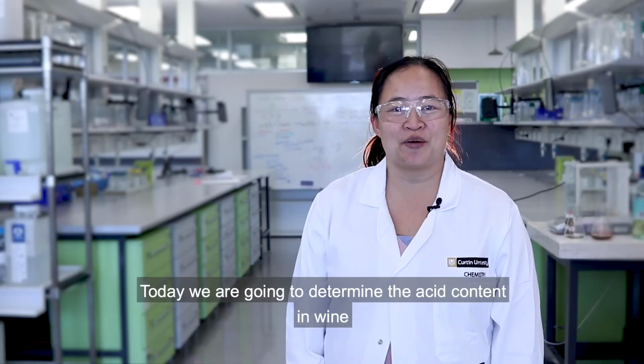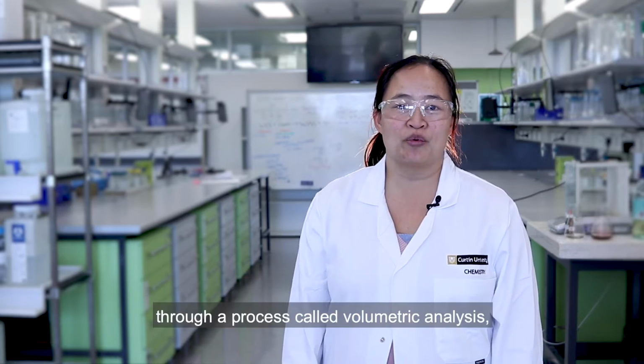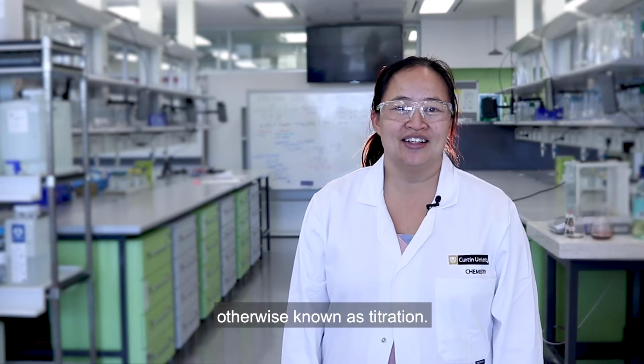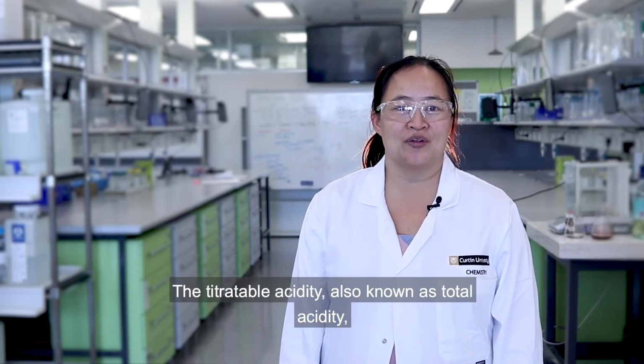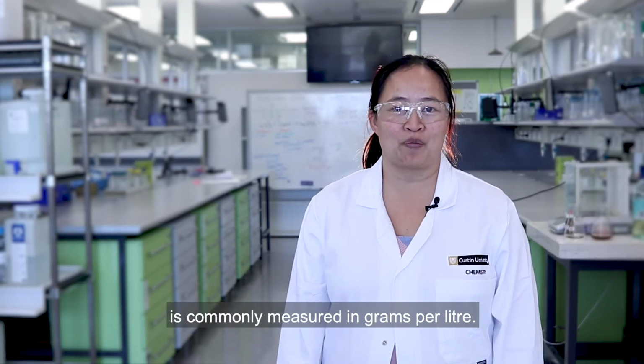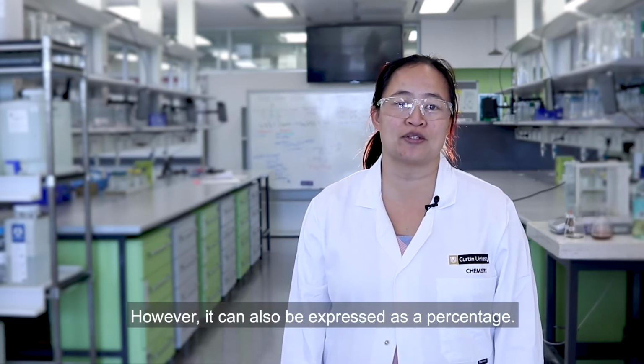Today we are going to determine the acid content in wine through a process called volumetric analysis, otherwise known as titration. The titratable acidity, also known as total acidity, is commonly measured in grams per litre. However, it can also be expressed as a percentage.